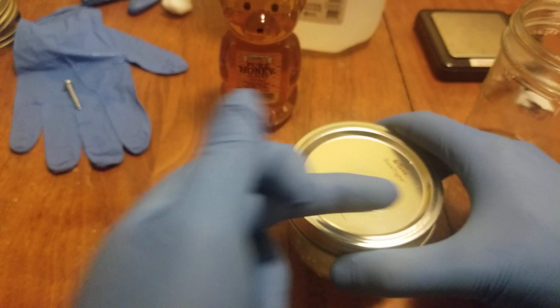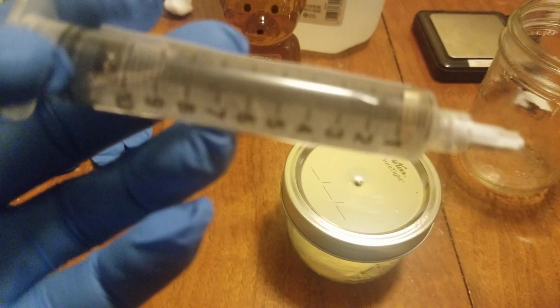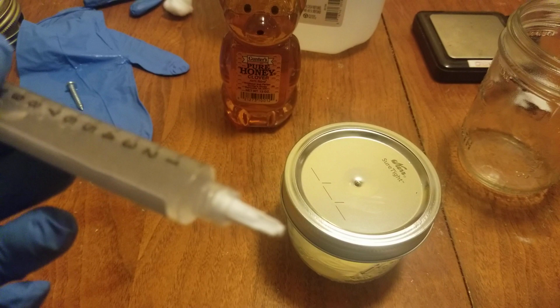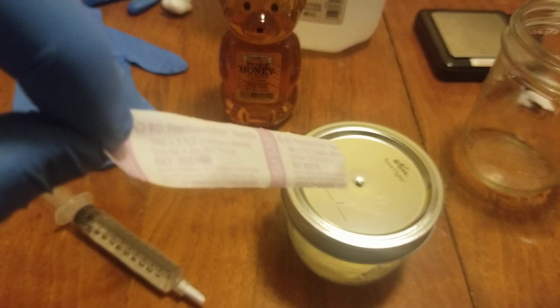So now, of course, we are going to grab our syringes. I have already taken the liberty of shaking it up. Let me try to be a good videographer and show you guys the spores. I've shaken them up, but I'll give them another shake again. This is a brand new syringe, so no special requirements to sanitize this. If you're using a used needle, of course, you're going to want to. The best method for sterilizing that is with flame, but we're also using a brand new needle too.